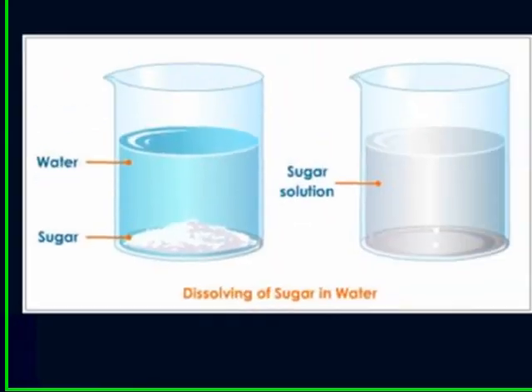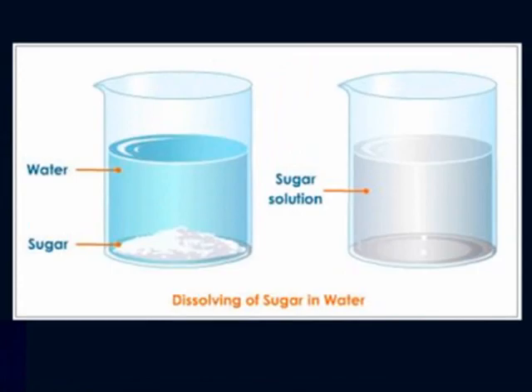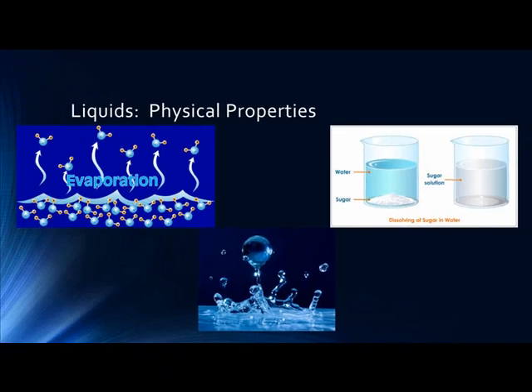shaped drops. You will also observe whether a liquid is able to dissolve sugar. Table sugar, also called sucrose, is a small molecule that will dissolve in some but not all liquids. Water, alcohol, and glycerin molecules all have unequal distributions of electrical charges and will form a homogeneous mixture with sugar molecules. You will find out whether these liquids will dissolve sugar during this lab.